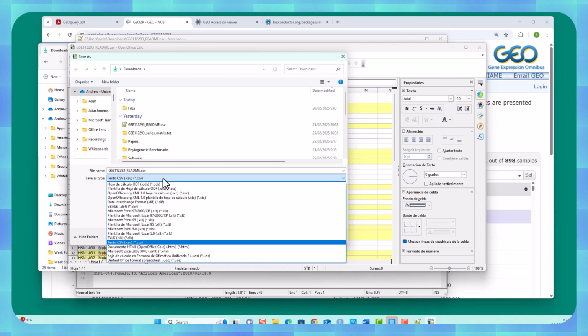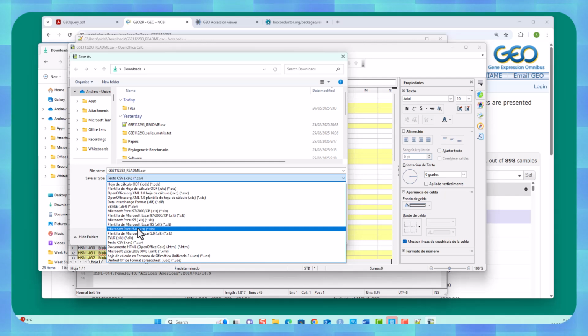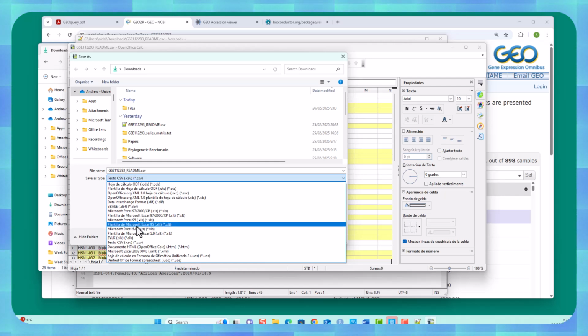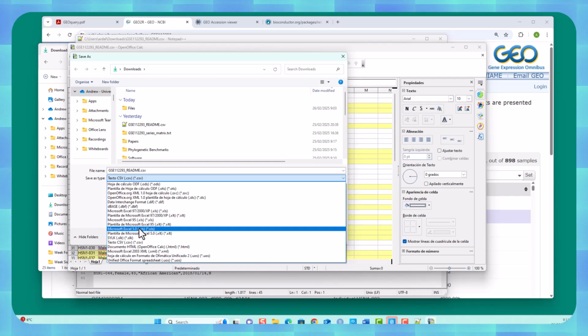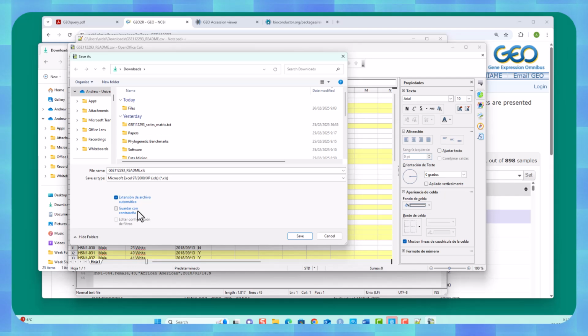I'm going to do it as an Excel file, and the only type that I can do is Excel 95, no. Excel 5, no. Excel 97 2000, whatever the Excel is. That's close enough. It'll have to do. So we'll do it as that. Excel will open it, but it won't open it with a great amount of happiness.